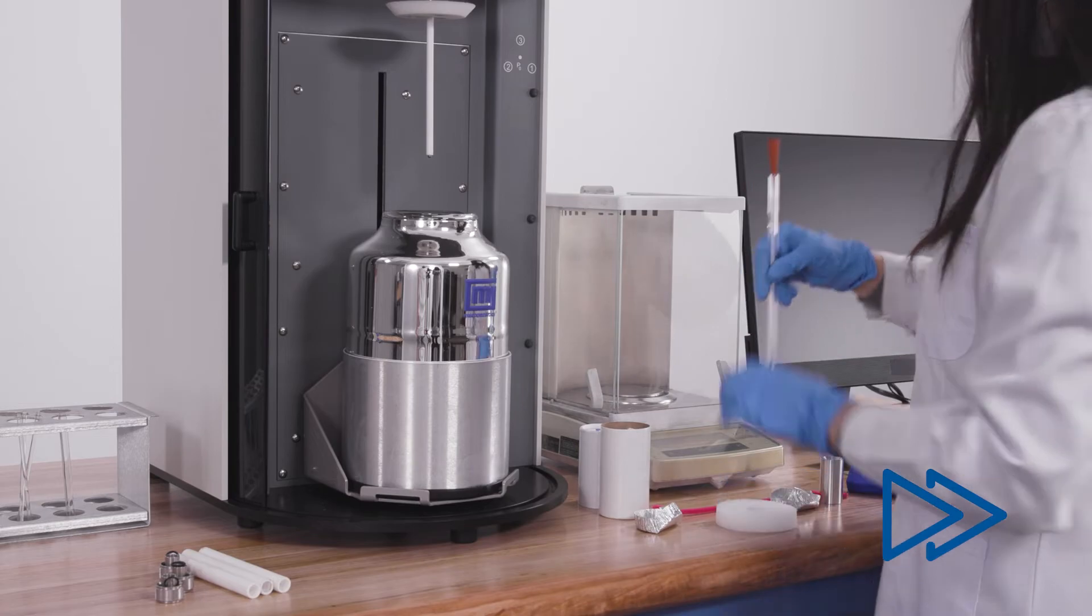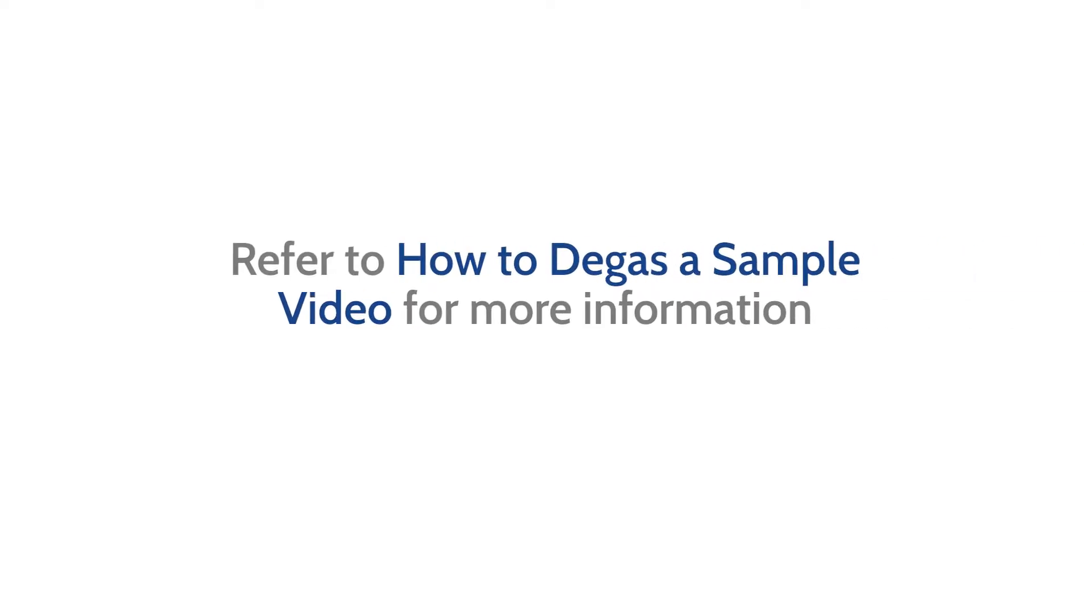Degas the sample with the appropriate conditions. Please refer to how to degas a sample video for more information.